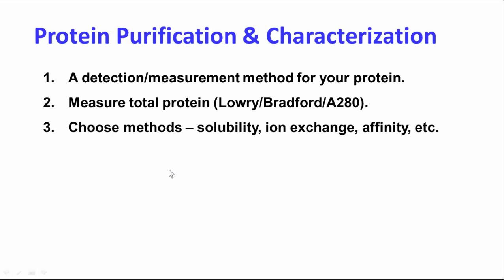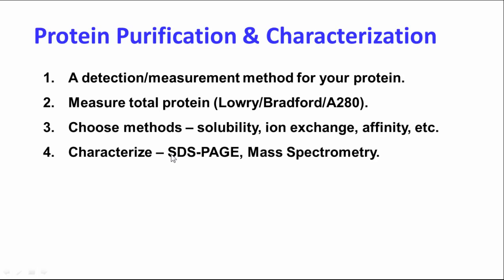So you choose your methods. You can use solubility, ion exchange, affinity, etc. to possibly purify your protein. We'll talk about those as we go forward.